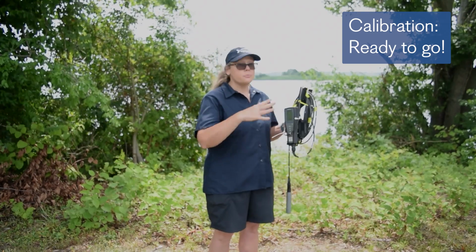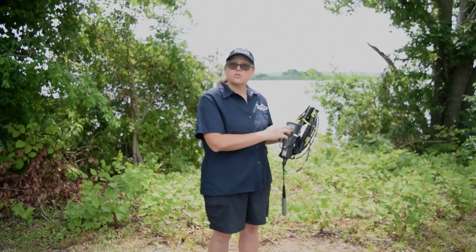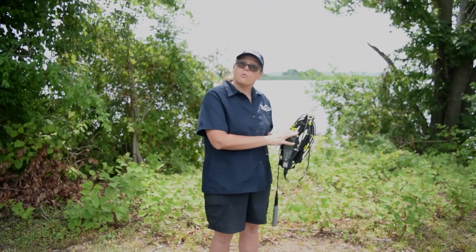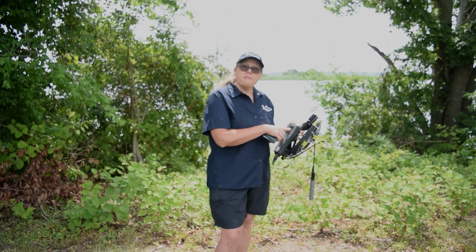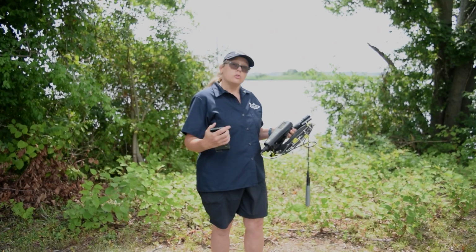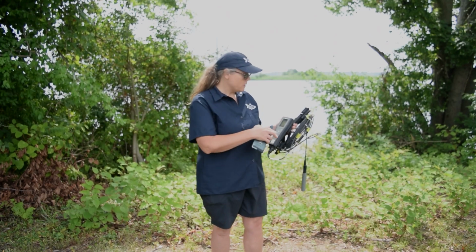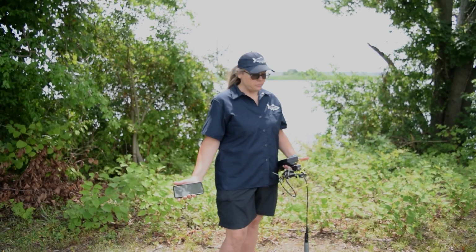Providing that your calibration went through successfully, you got calibration successful, and your DO percentage was within the plus or minus 2 percentage points of your expected calibration value, you are now ready to use the meter at your site. If this number is not within plus or minus 2 percentage points, you need to troubleshoot, because if you use your meter, we're not going to be able to use any of your data and it's all going to be flagged. So what can you do to try to correct an inaccurate calibration?